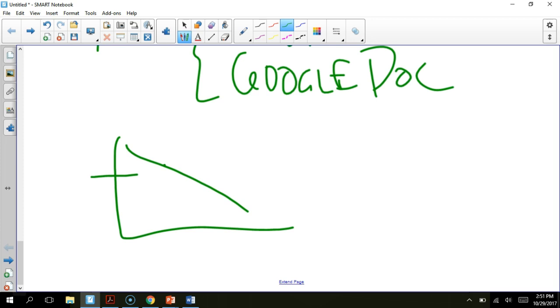This isn't going to be terribly long. It's going to have a couple of sections. It's going to have your proposal, which is going to be your general procedure, and then it's going to have that data table, which is like your physical constant sheet. So there's not necessarily a ton that goes into this, but it still kind of consists of all the different things that we have learned how to do up to this point. Okay, so there it is. That's what you're expected to do for your proposal for the forensics lab.